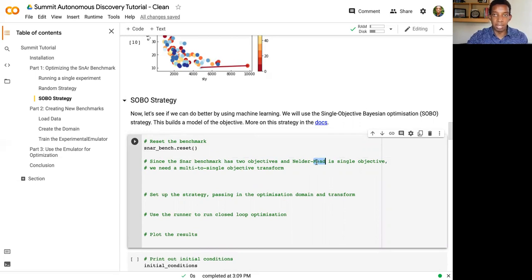And then we optimize that model, because now we have something that's cheap to evaluate, to find what should be our next conditions. And we don't exactly optimize the model. We actually optimize something on top of it that gives us a balance of exploration and exploitation. So finding new conditions that we haven't looked at before, as well as exploiting and trying to just maximize near what the best points have been. And so that's called an acquisition function.